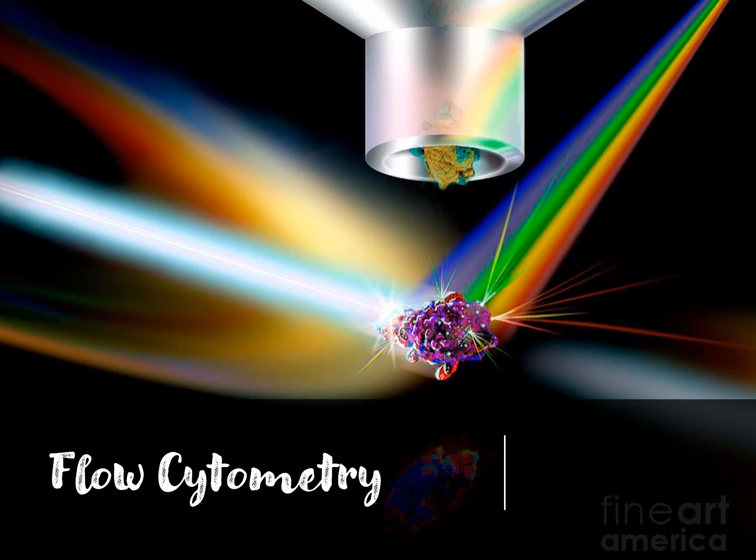Well, we will be discussing it in detail, but let it suffice to say that it works on the principle of immunofluorescence. So a couple of lectures back, we talked about immunofluorescence, and one of the applications of immunofluorescence was flow cytometry.